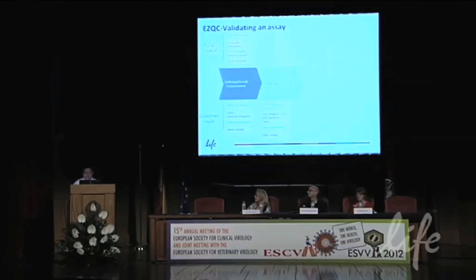Once you define that environment, you then execute your study. Whether that's a validation, a verification study, a calibration study, or a QC monitoring study, you choose a study, you set your acceptance criteria, you select your guidelines, you input your reagent lots, and what you get from those inputs is a complete protocol. And this complete protocol encompasses data entry forms, plate layouts.